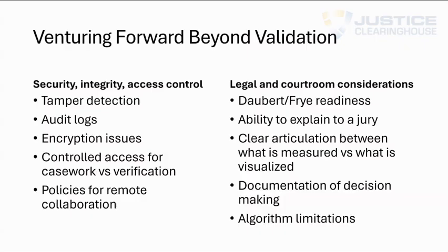And then there are legal and courtroom considerations. What's the Daubert-Frye readiness for virtual comparison microscopy? How good is your ability to explain virtual comparison microscopy to a jury? We're going to have to go through that process of learning how to clearly articulate not only what VCM is, but also a clear articulation between what is measured versus what is visualized. And then what is the documentation going to be of decision making? What are the algorithm limitations?